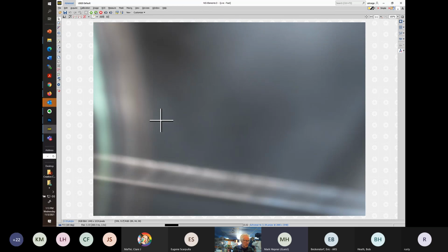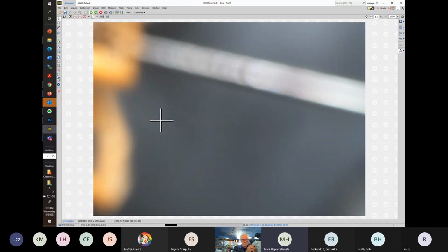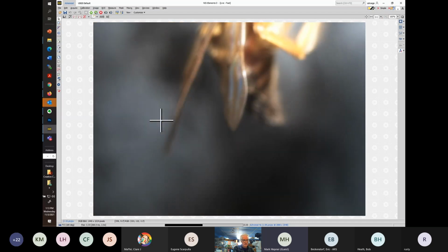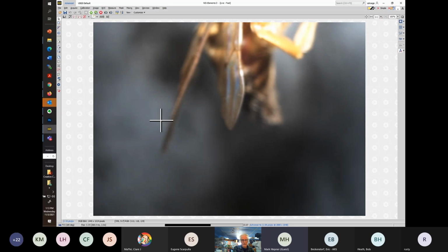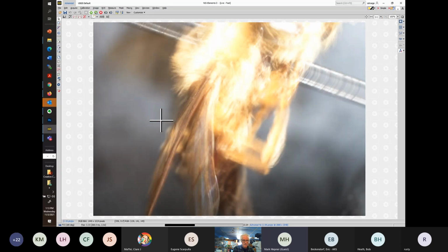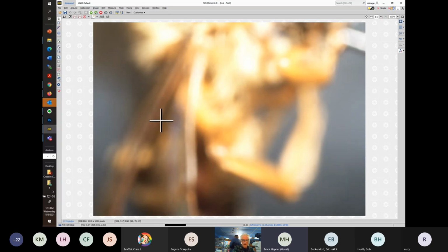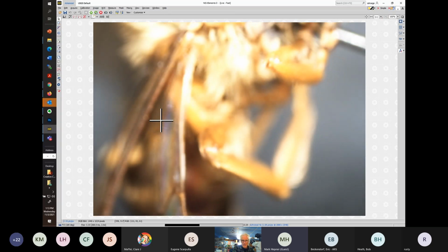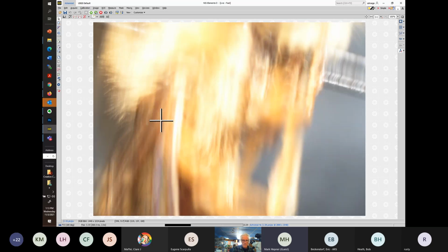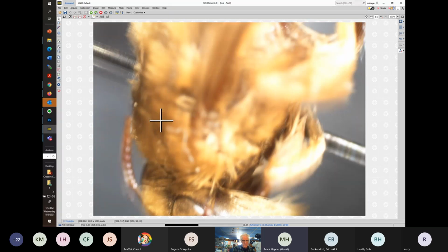We'll take a quick look at the feet and the tarsal claws, rather. And the reason for that is if there is no arolium, that also eliminates a bunch of species. I forget whether it has it or not, so we have to look it up. This is much easier when you rotate your specimen in your fingers rather than trying to do it as I am.